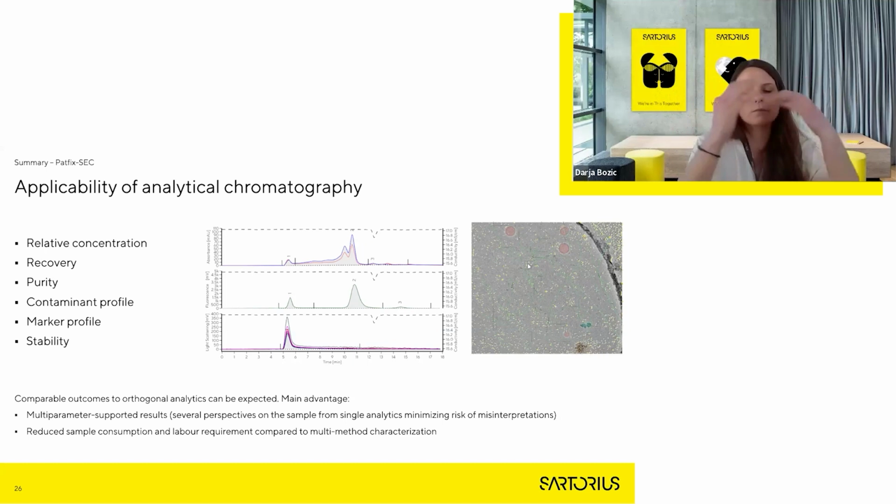One can address this by lowering the flow rate of the analysis, decreasing the shear stress on the particles, and optimizing the running buffer conditions. I would go for these aspects first. But in our experience, the stability or damage of the particles within the analytics is not such a very big issue.